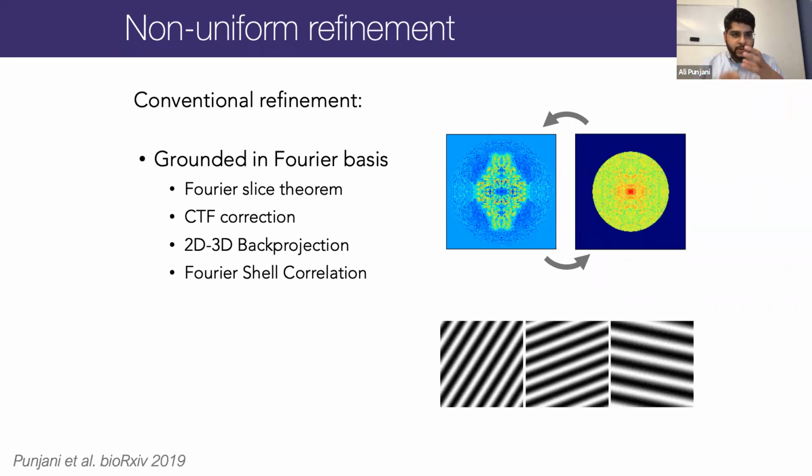As soon as we get into a territory where things like particle alignments are driven by noise, over iterations of refinement they can start to accumulate error that reinforces itself, and overtakes the real structure of the protein in driving those alignments, destroying our ability to resolve the structure of the protein. Thanks to the methods that I talked about earlier, like the gold standard FSC technique and using FSC for regularization, we don't see overfitting in such a drastic way anymore these days.